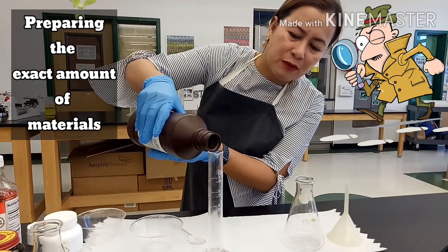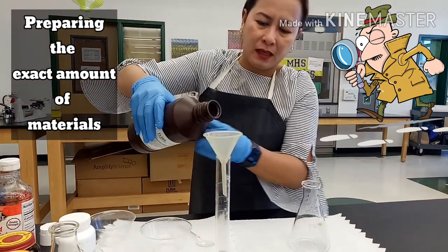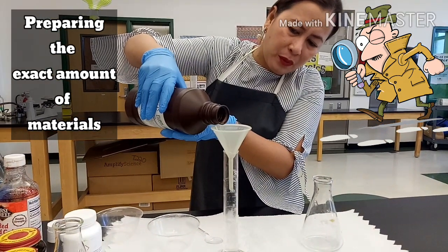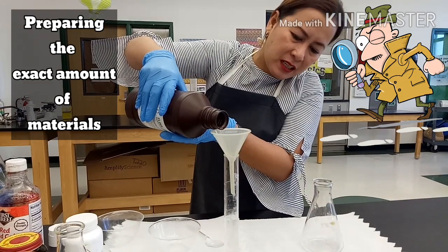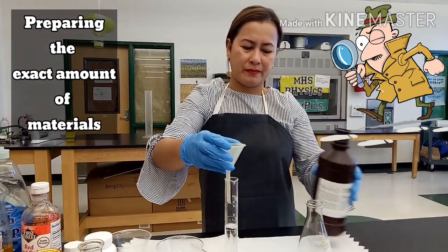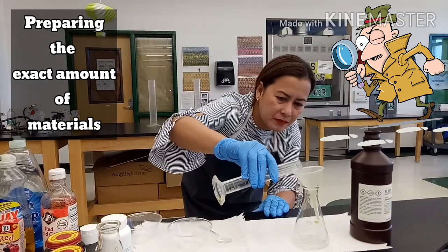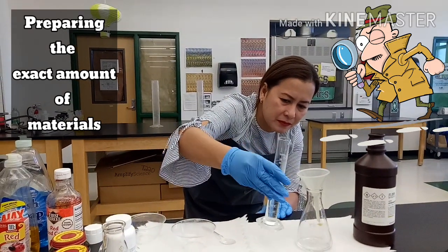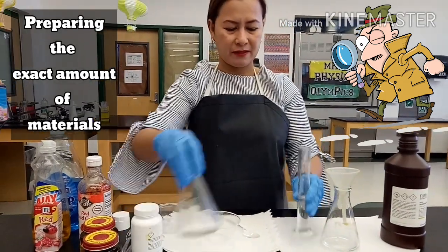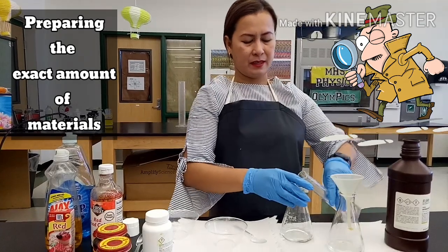So what we just need for this one is, using the funnel, we will be pouring this one, transferring it. We will just be using 30 milliliters for this one. Since it's too much. Alright, so transfer that one on this side. There you go.